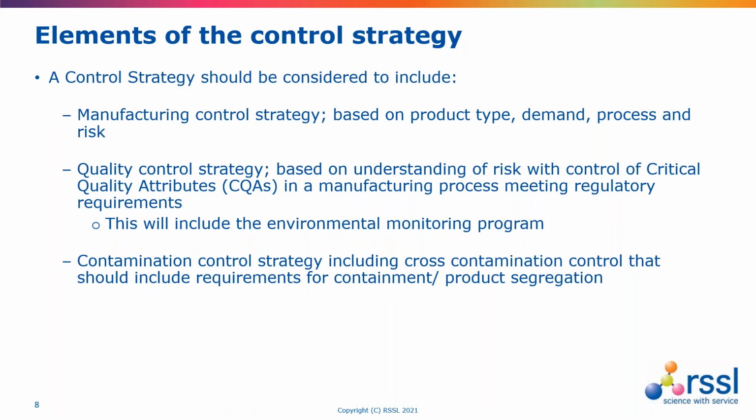And within that broad umbrella, we would also have environmental monitoring as well. And we also need to capture the elements of cross-contamination. So that would extend to cleaning and storage and things like wet equipment and avoiding the recontamination of clean equipment with dirty equipment, for example.